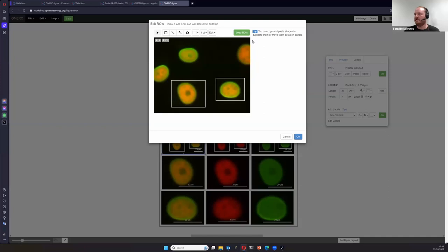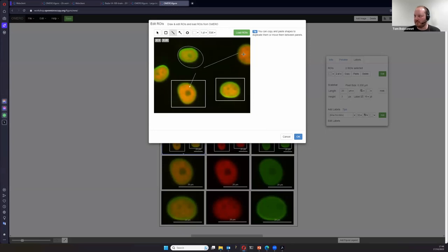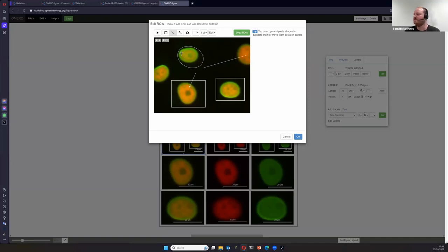In the region of interest panel, there are other things you can add. You have arrow types — if you want to show a detail in your image, you could create arrows, circles, or place bars if that makes sense. Unfortunately, a feature many people request is the ability to put free text inside the images, and this is not currently possible. This is something you would have to do after exporting the PDF and adding text there.